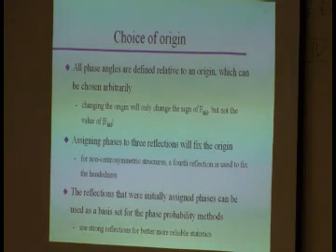At that point in time, it then chooses an origin, because all your phase angles are defined relative to the origin. And that origin is arbitrary. You just have to keep everything relative to the same origin. The only thing that will change, especially in a centrosymmetric structure, is the sign of F(HKL), okay? But it won't change what your intensity is. If you take 3 reflections and you assign phases to them, you've pretty much fixed your origin. In a non-centrosymmetric structure, you would take a 4th reflection, because you still need to determine the handedness, right? Non-centrosymmetric structures are not achiral.